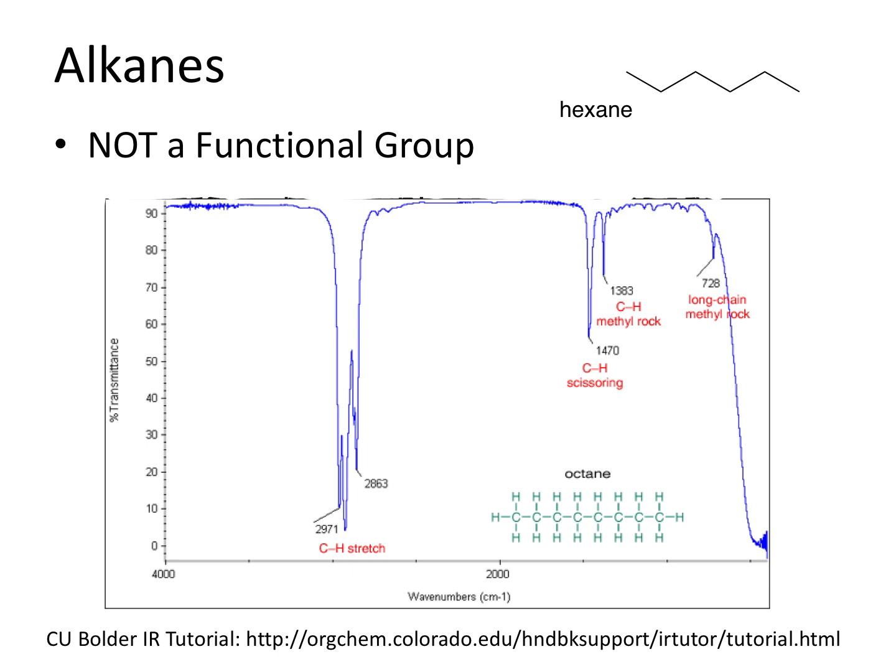So here's what the IR spectrum looks like. If you look, it has a few things on the right, but the most important peak you see is right here on the left. But that's going to be in everything that has an alkane. So basically, we're going to have to learn to ignore that big blue one around 3,000, slightly below.